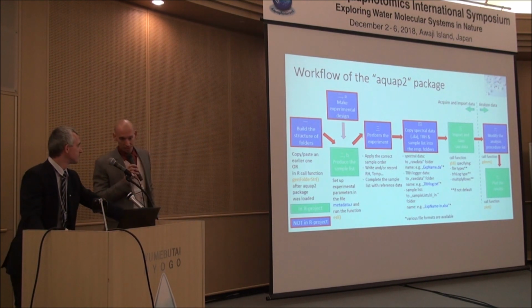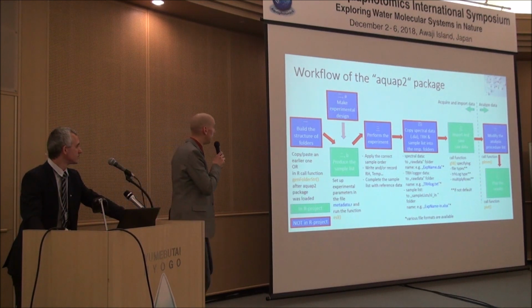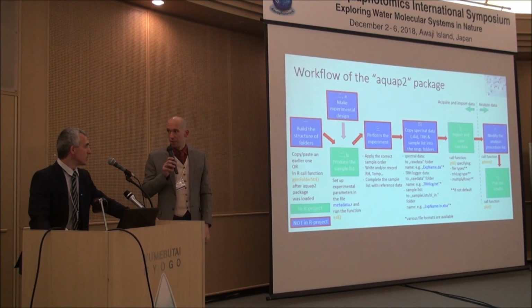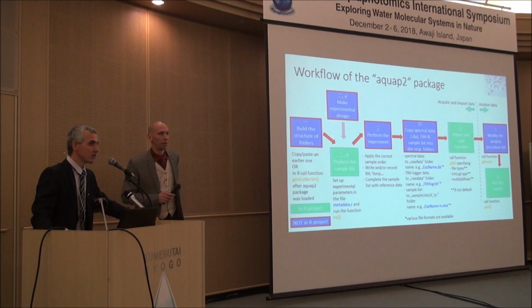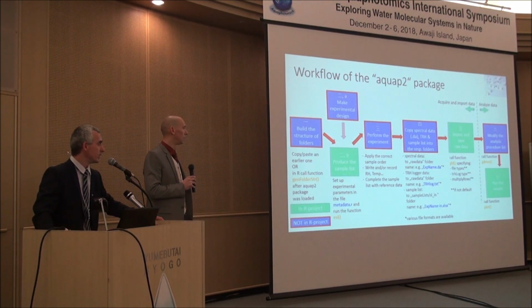So the first part of all your experiments is you need a folder structure. Yes. I think this slide briefly summarizes a general workflow, how you can use this aquap2 package in your analysis.